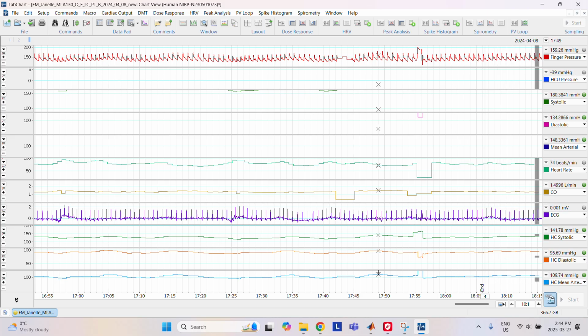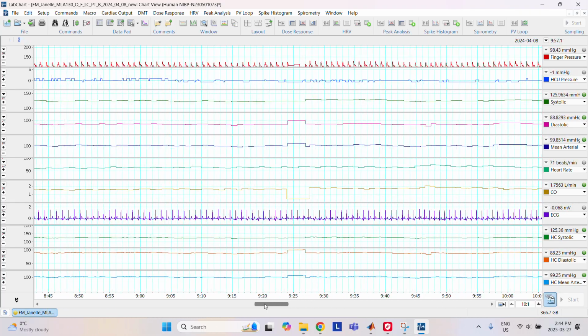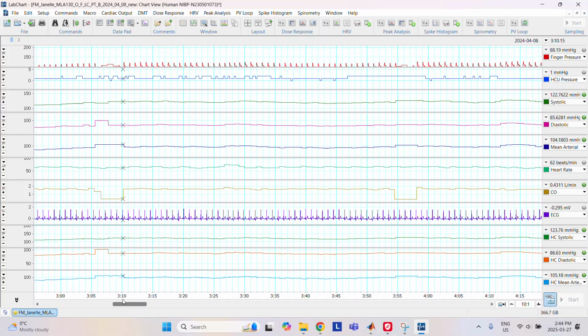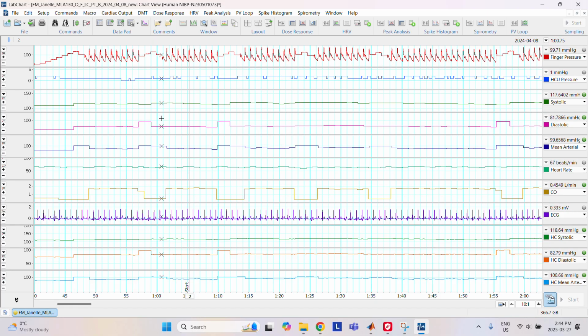Okay, so now that you've run through and you've seen where there's potential for noise, you just want to keep that in mind for when you actually run the macro. So next, we're going to go back to the start, right? And then you want to click about 2 waves before the actual start comment. Make sure you're clicking right where the time is, not on the actual channel, because that wouldn't work. You want to click where the time is, and get to the top of the channel as close as possible.